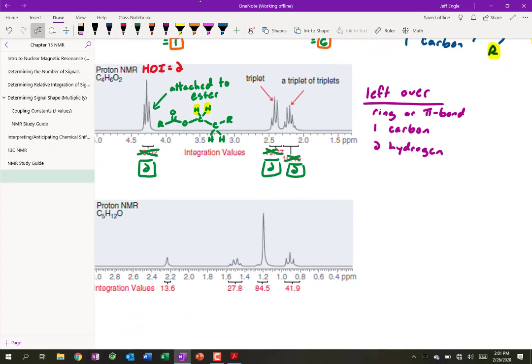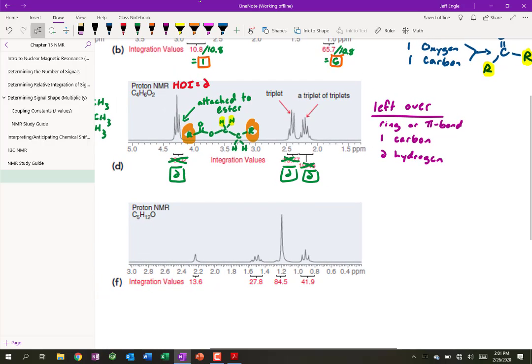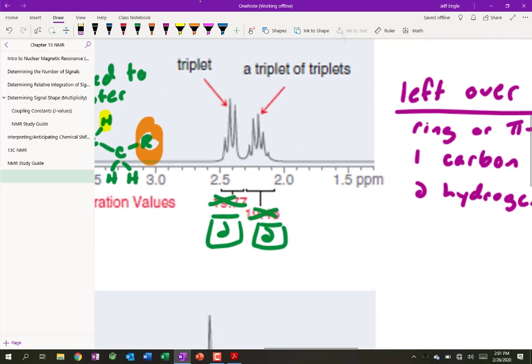Maybe this R group right here and here is the same carbon just looped around into a ring, right? That could account for the HDI of 2. So what in the heck would this ring system look like? Oh man, let me zoom in more. I can't draw that small.